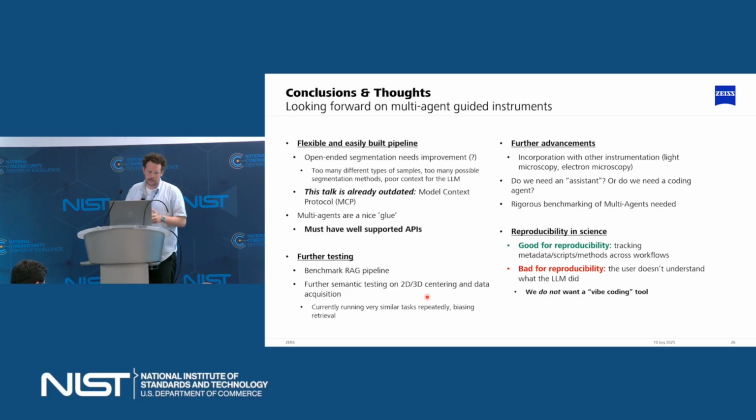And finally, a topic that's been talked about: documentation. The whole workflow is very well documented. All the Python scripts you wrote and all the parameters you chose are saved right there with the multi-agent.